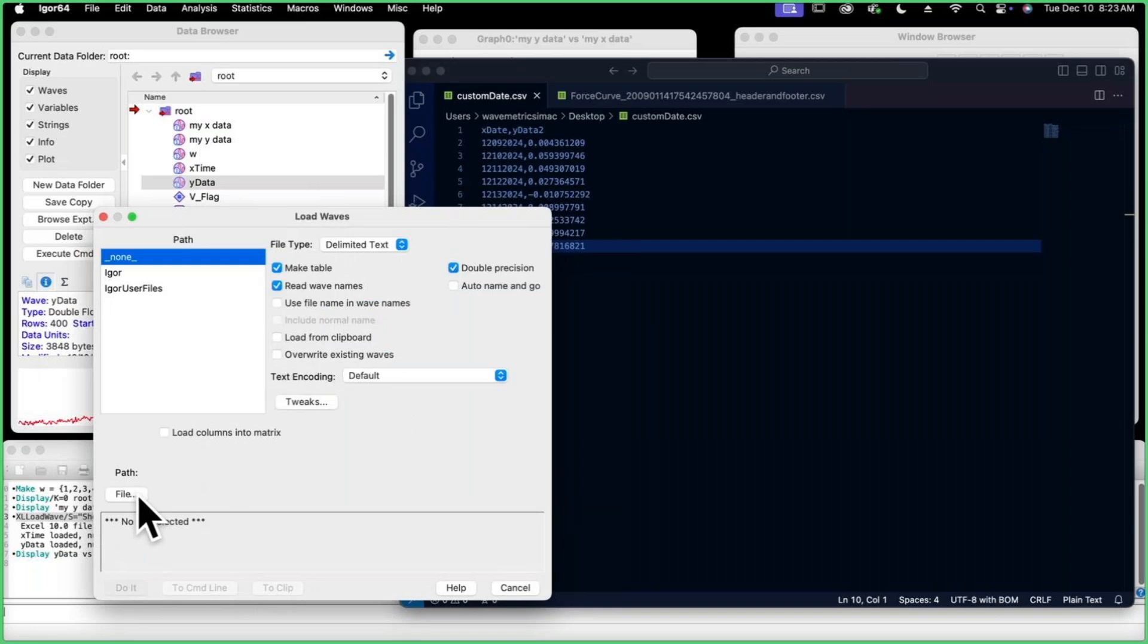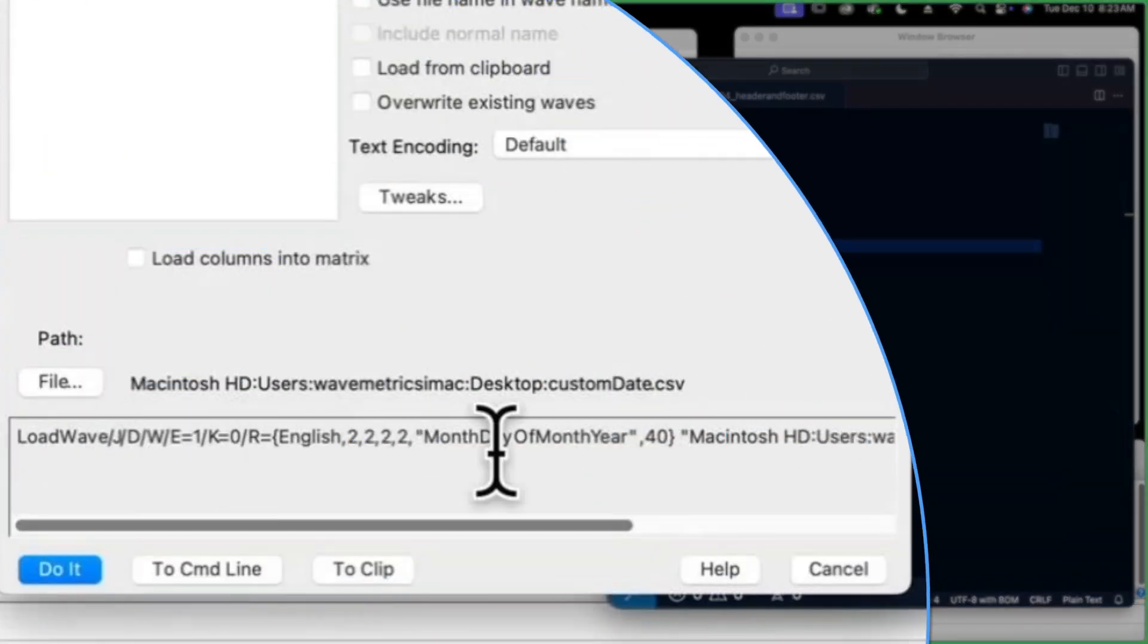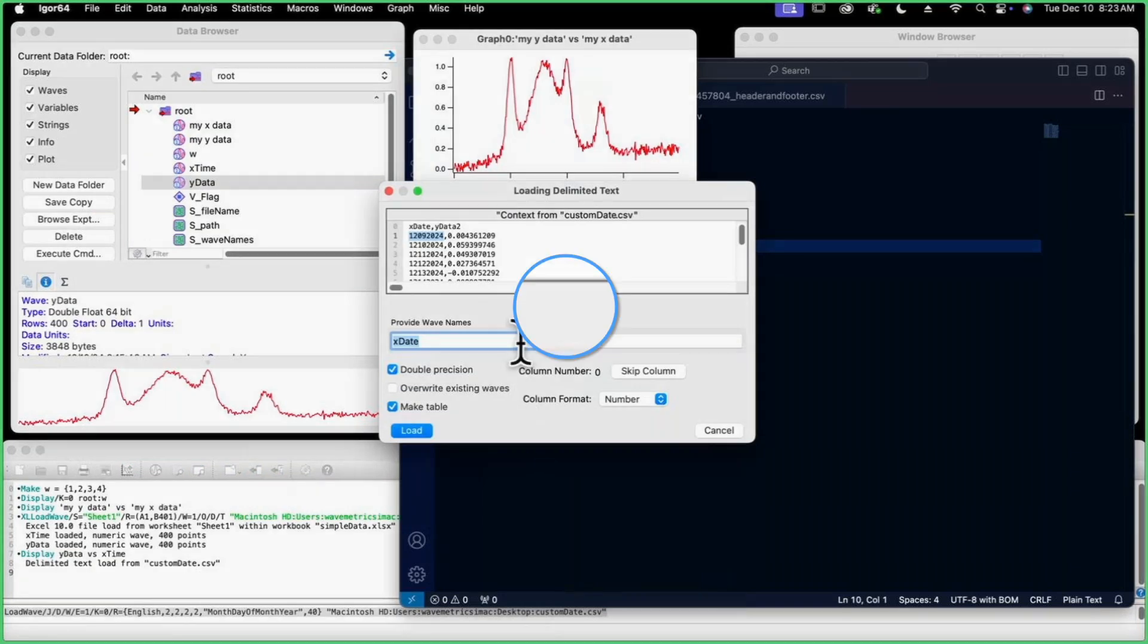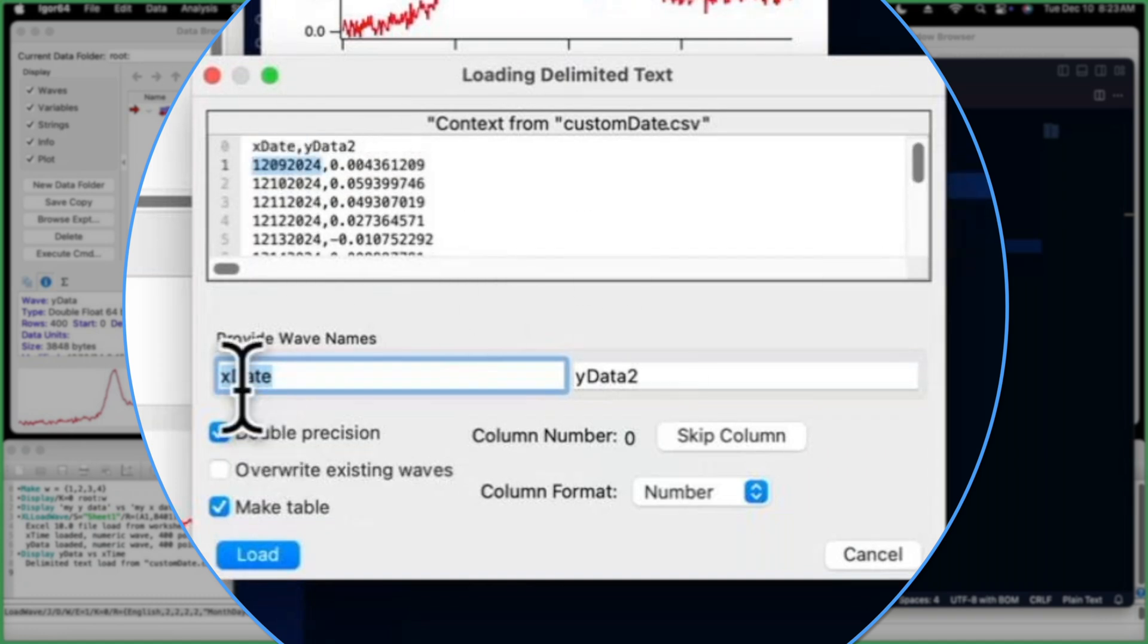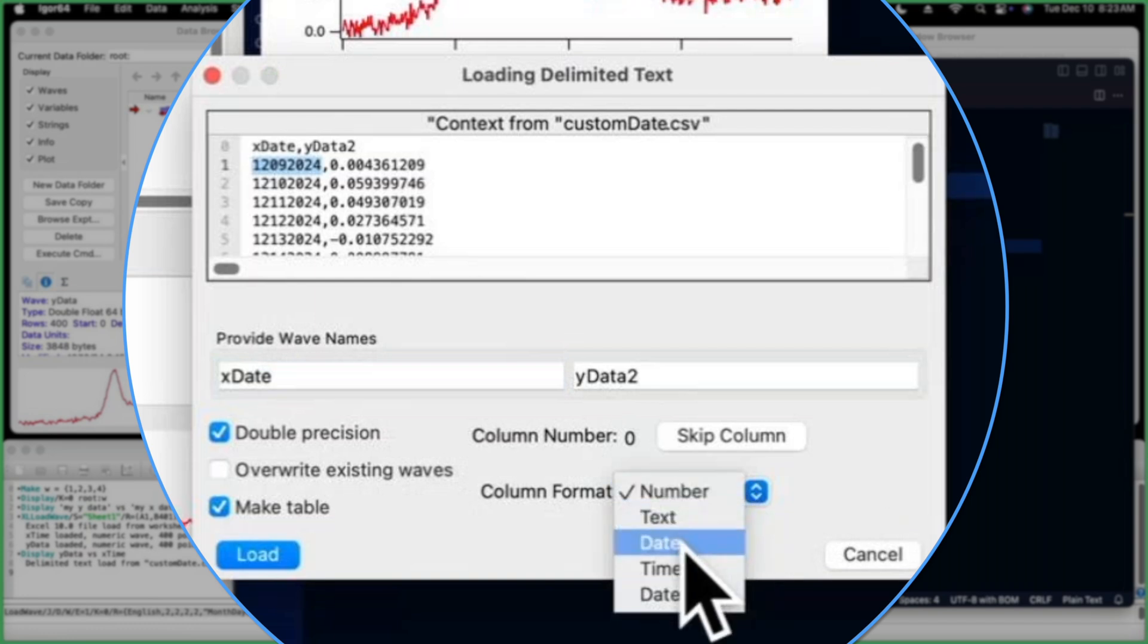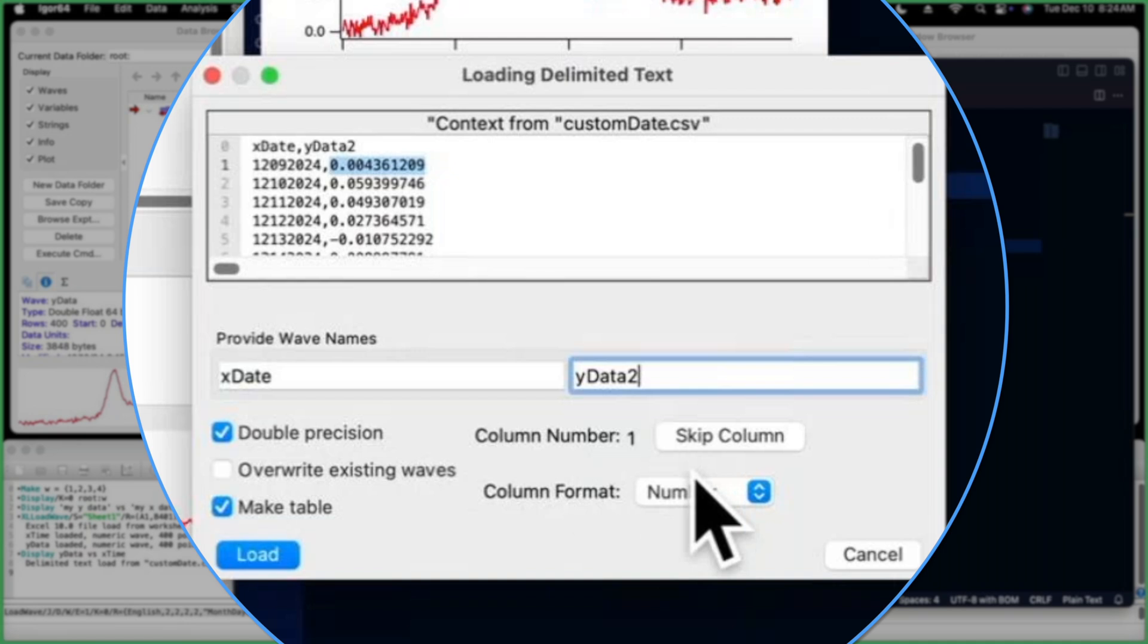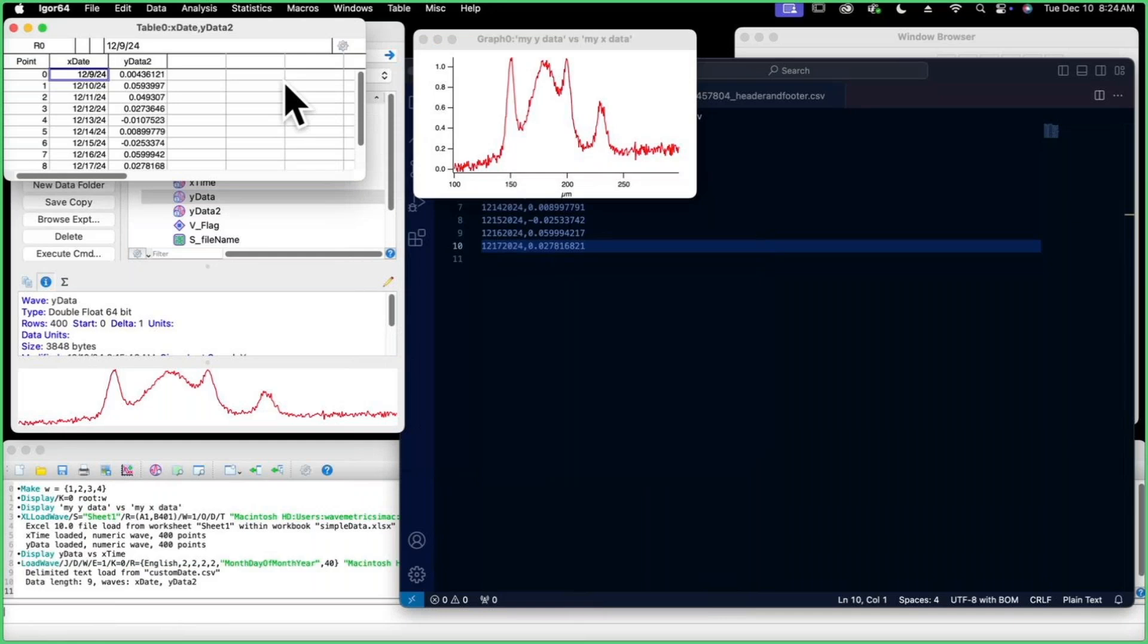And then we'll select the file, this is our custom date CSV file, we'll open that. Here's the command that's going to be generated, and we'll do it. Now, after you've done any custom tweaking, you'll see this preview of the data that's going to be pulled in. It named X date, that's good. The column format is number here, and we want to show it that this one's a date, so we're going to hit that. This is the name of the Y data column. That's just a number, double precision, that looks great to me, and we'll hit load.